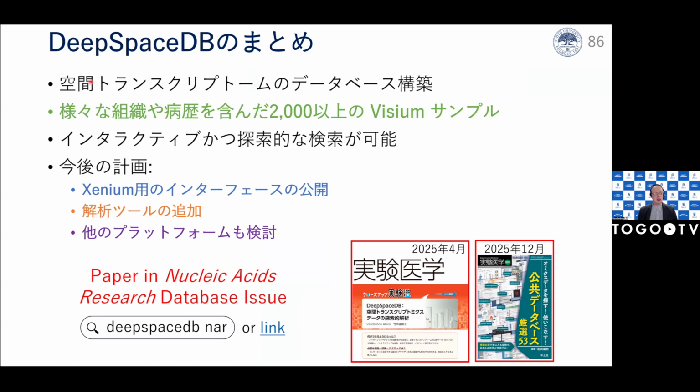So as a summary, we made DeepSpaceDB. It's a spatial transcriptomics database, and it includes more than 2,000 Visium samples covering many tissues and diseases. And the interface, I think, is interactive and intuitive and useful for exploring the data. This is my future plan, but actually we made the Xenium interface public, so you can access the data in our database now. And maybe in the future, we will consider adding other platforms also.